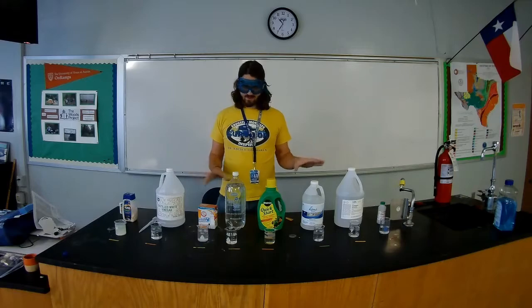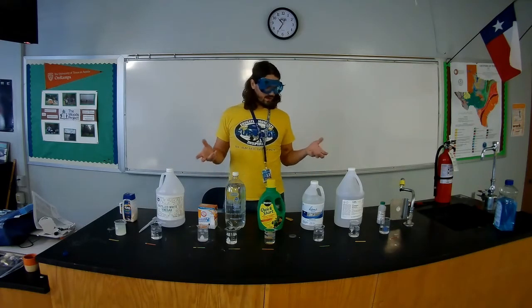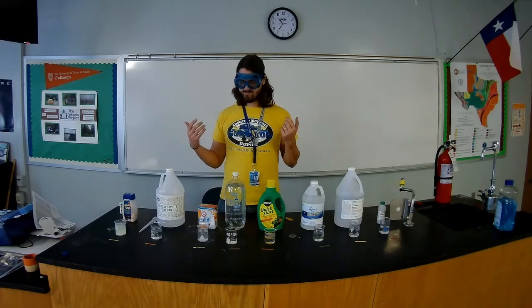We reviewed 8 pretty common chemicals in the world, and all of these chemicals, or most of them, will come up again in the class, so it's good for us to begin discussing them. But what you can see is that there's a wide range of pHs here, and acids and bases. Generally speaking, a strong acid and a strong base will have a very strong chemical reaction with one another. Not only can we learn what is an acid or a base, but we can also compare the strengths of different things with this approach of measuring pH.